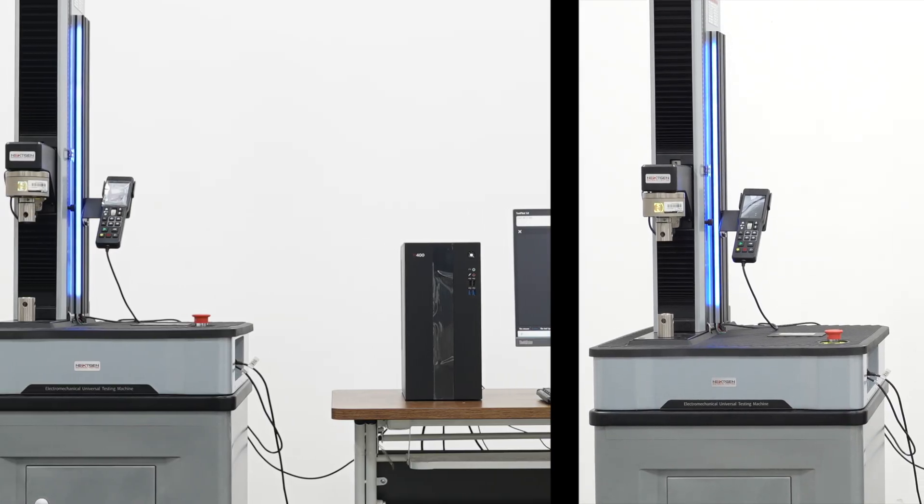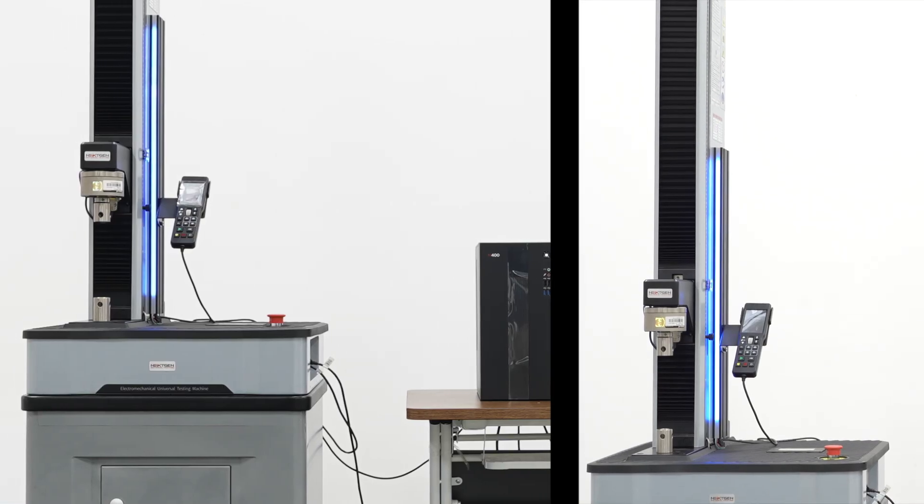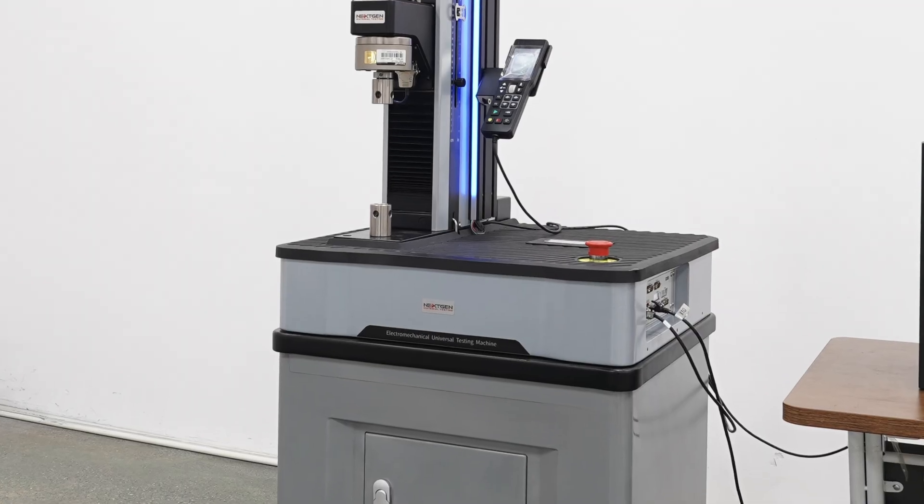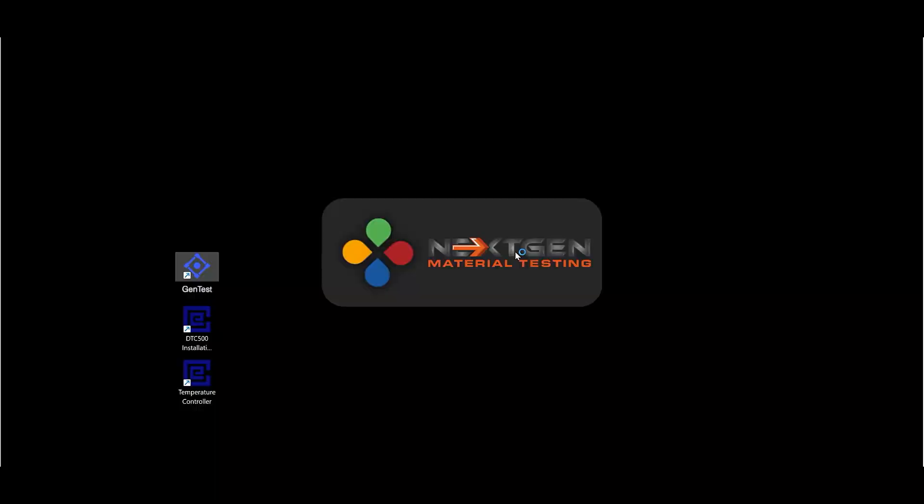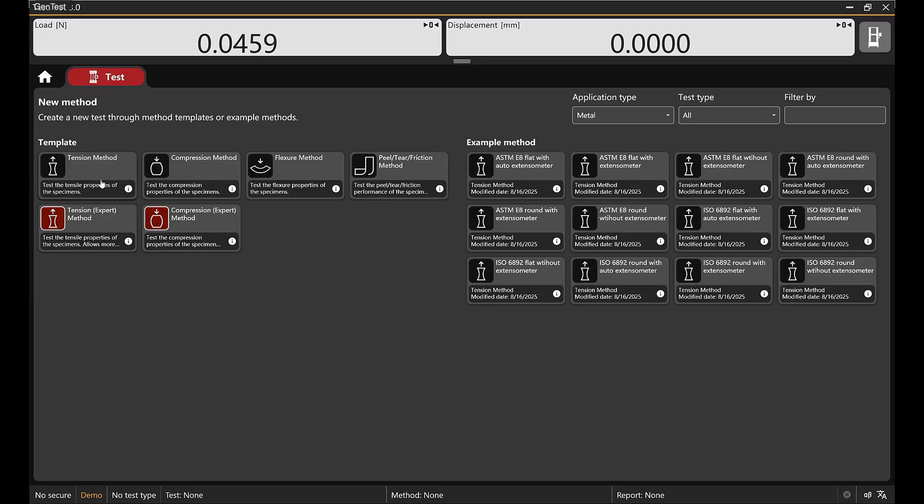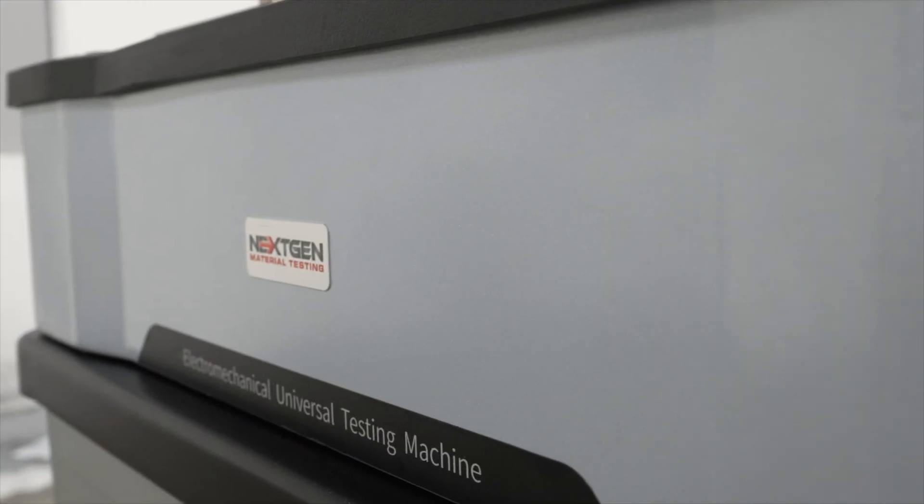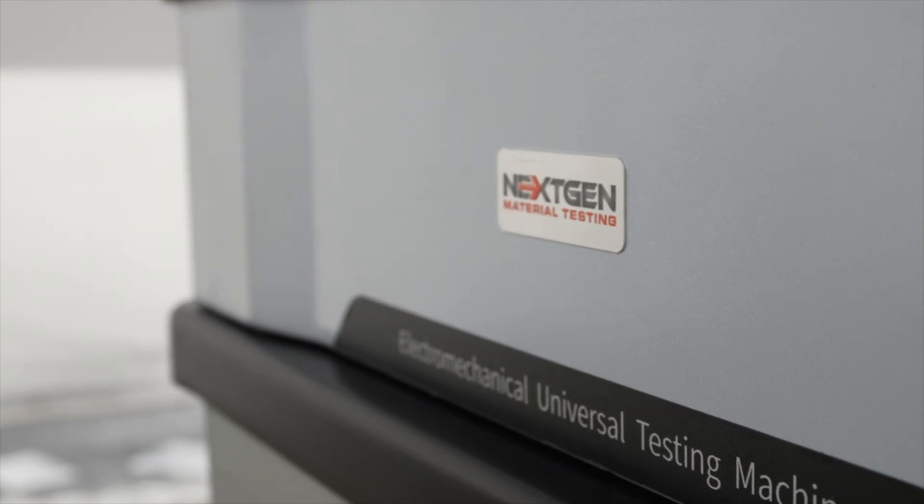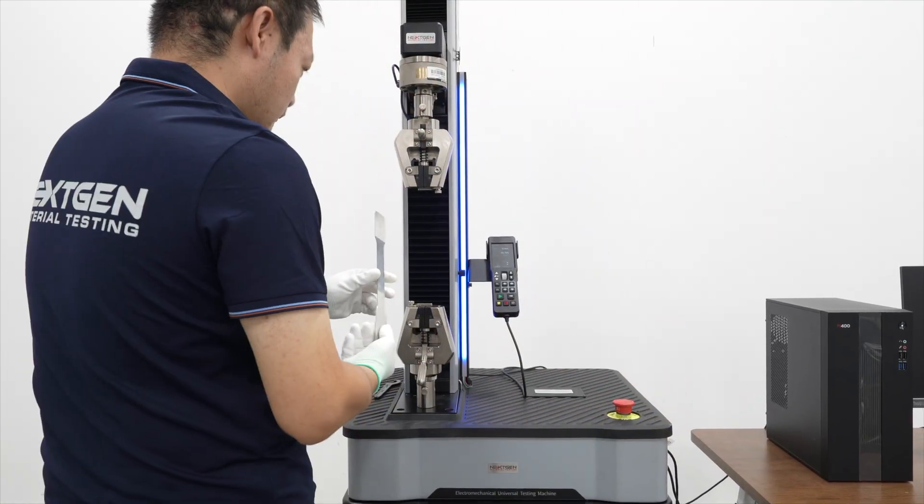Presenting the next-gen single-column benchtop universal testing machine Series A, designed for compact, precise materials testing with ultimate user-friendliness via intuitive GenTest software with touchscreen navigation and preloaded standards, leading dependability and reliability enabled by a rigid, space-saving single-column frame.